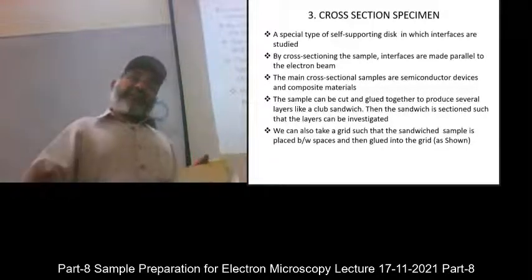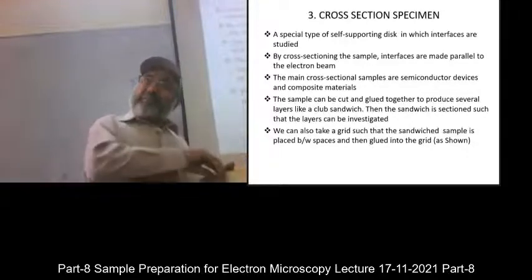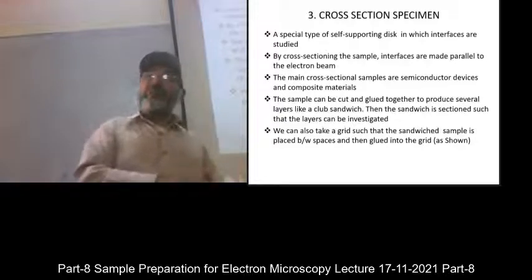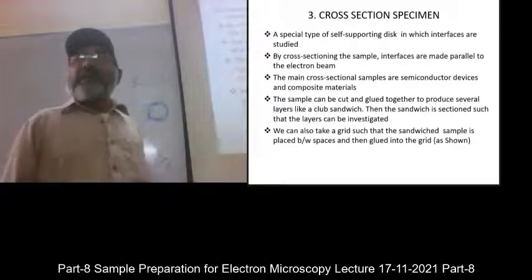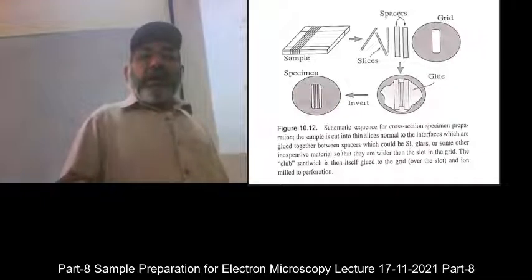If it interacted with the already present structure and replaced the lithium ion, then that will make another type of structure there. So what happens because of diffusion? When you want to see them directly, then this cross-sectional sampling is used for that specific application.